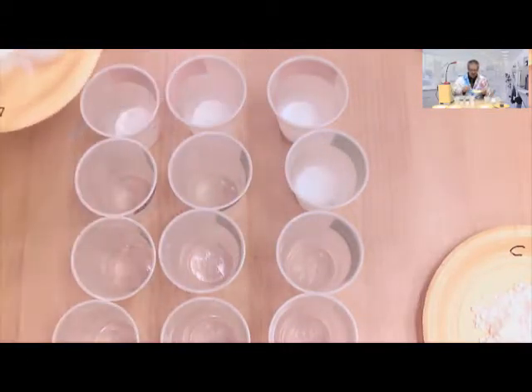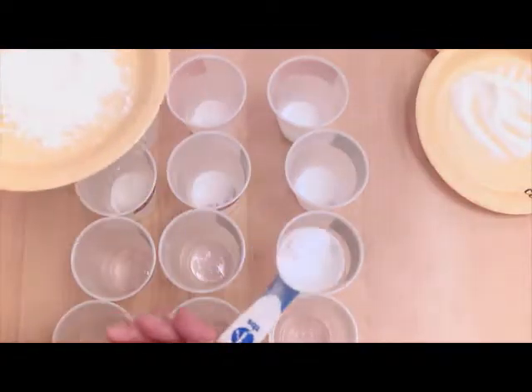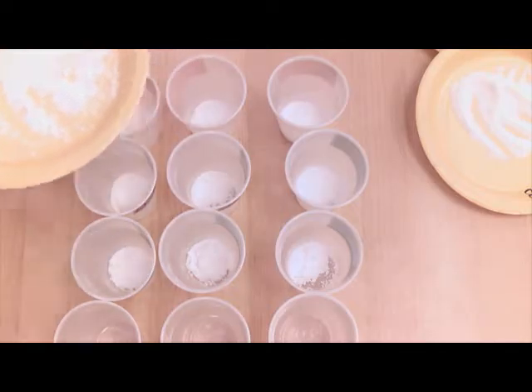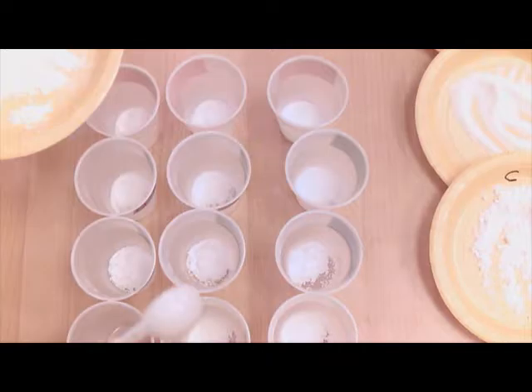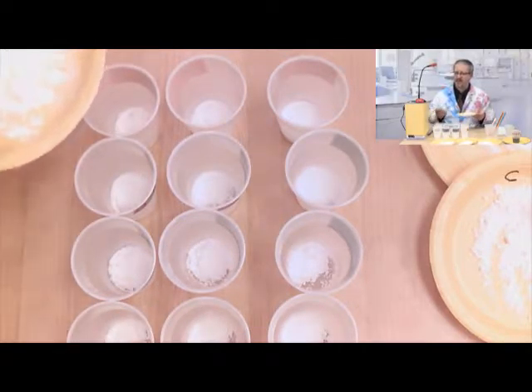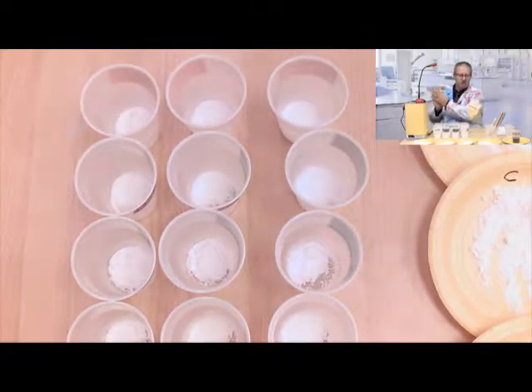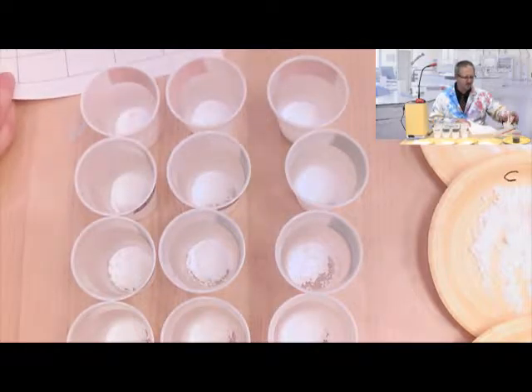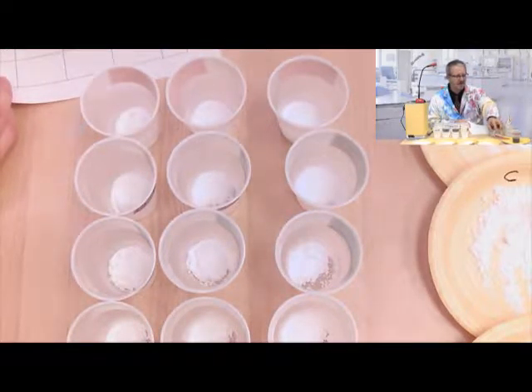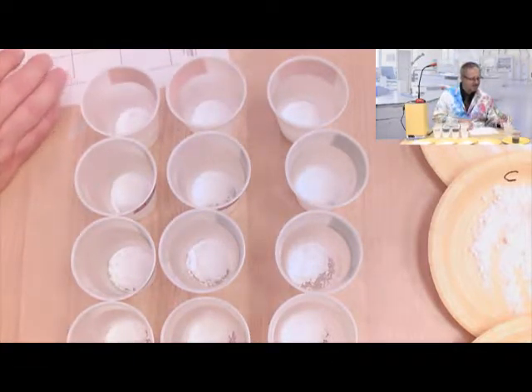All right, so here's B. Okay, now we have all of our powders in. So we're going to start. Don't forget we have to do observations. So what I've done, I don't have an eyedropper, and I don't have pipettes.